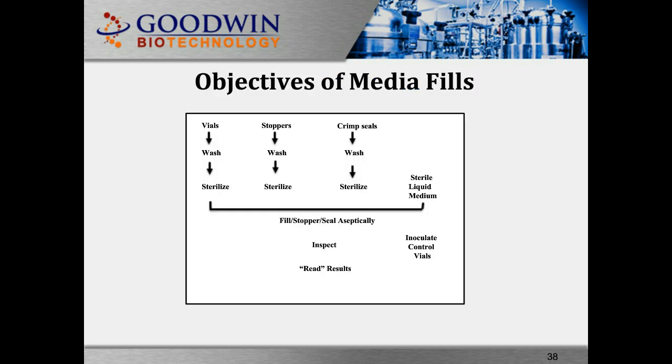For media fill qualification or any fill, the components have to be washed using WFI and/or sanitized and then sterilized using the autoclave, or the glass vials depyrogenated, and filled in a class 100 room, then stoppered and sealed using the sterile liquid medium. Once they are filled, they should be incubated at two different temperatures: a lower temperature of 20 to 25 degrees for 7 days and 30 to 35 degrees for another 7 days. The total number of days incubated will be 14 days. At the end, the test will be read and the results will be provided.